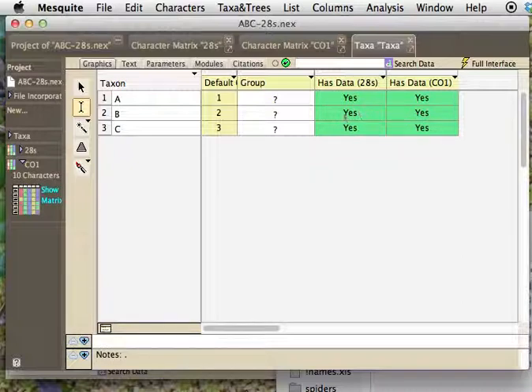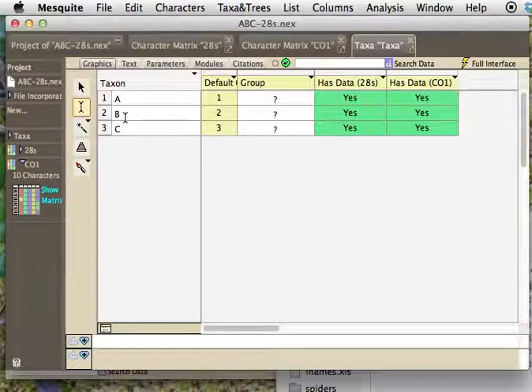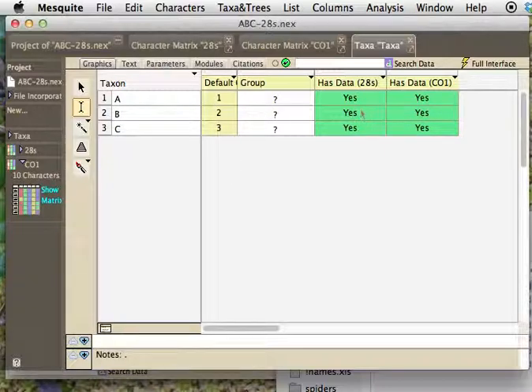But you'll notice what it's done is that it's pulled things together like this. So now that one has the single taxon has data in both 28S and CO1. And in fact, if there had been data under both of those in one of these, there would have been a little warning given, and strange things might have happened.